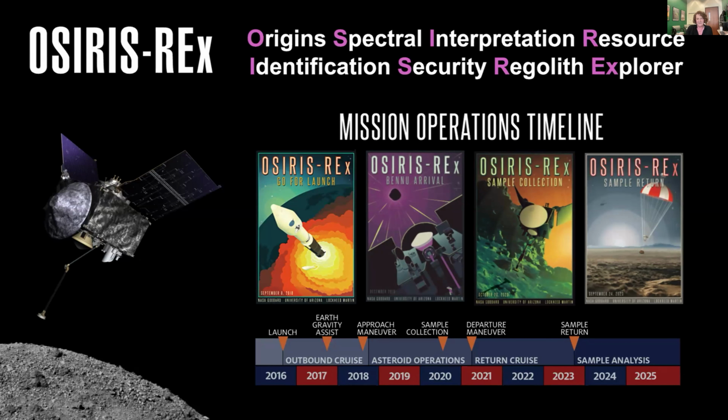Now, this is NASA's first asteroid sample return mission. And with any good NASA mission, it has to be an acronym. So OSIRIS-REx stands for Origin, Spectral Interpretation, Resource Identification, Security, Regolith, Explorer. I will let you decide whether you think that is a good acronym or not, and there will be a pop quiz at the end of the talk. But this mission was really designed to go to an asteroid and bring samples back so that we could analyze them with these electron microscopy tools in the laboratory.